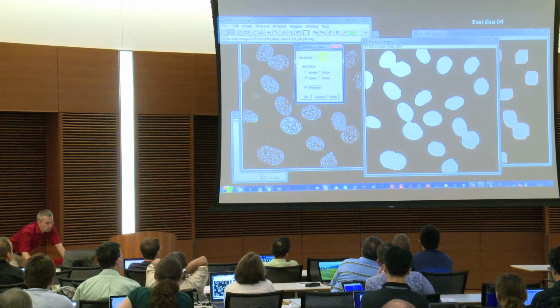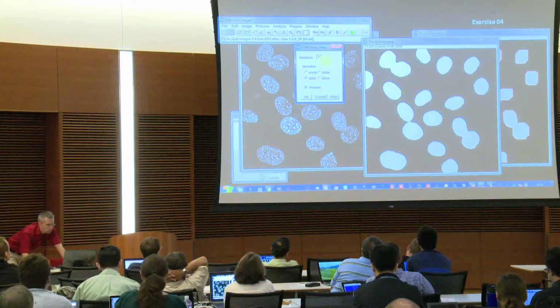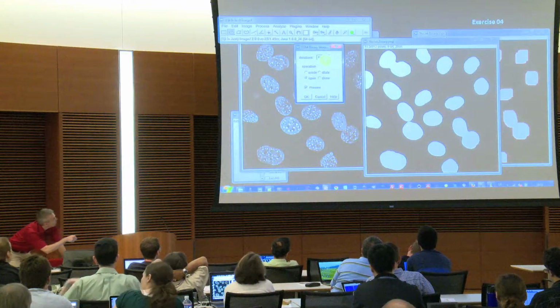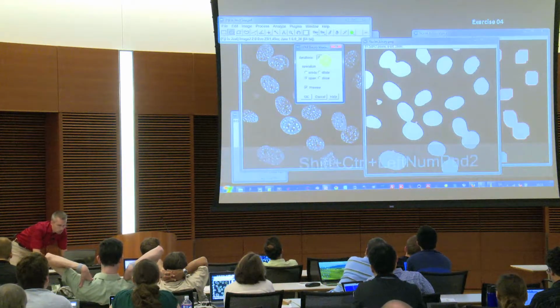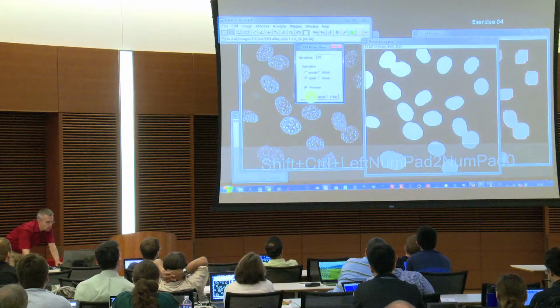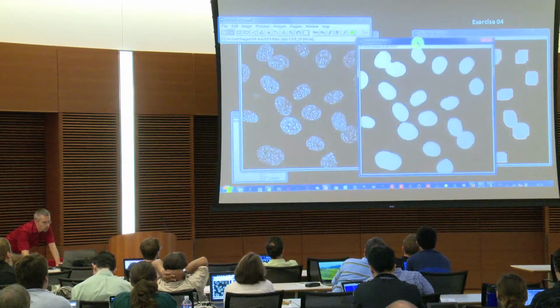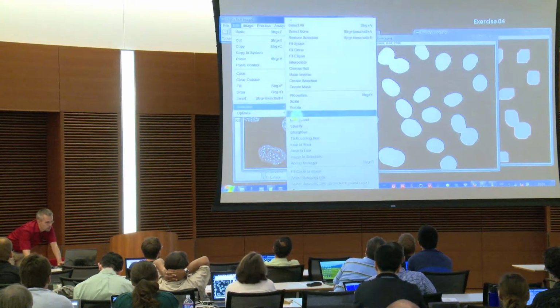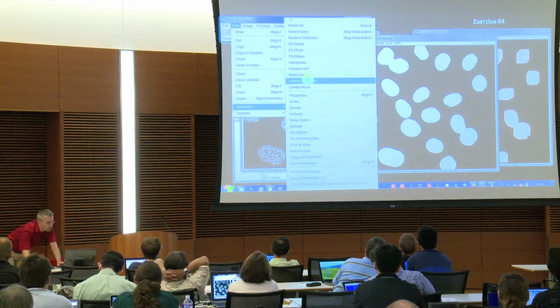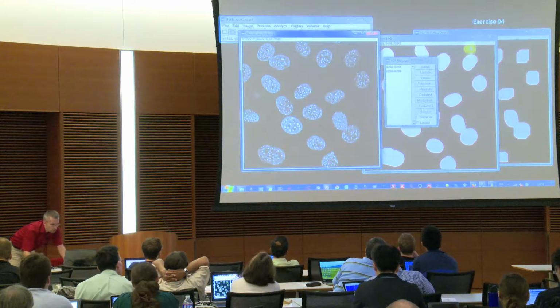And then you see, I have them roundish. Actually, I can go to 15 or 20. Then I have this also separated directly, and it does not alter the shape too much. So you see in comparison, here I keep the shape, and if I create a selection from that one, put it to the ROI manager, we can compare that on the original.